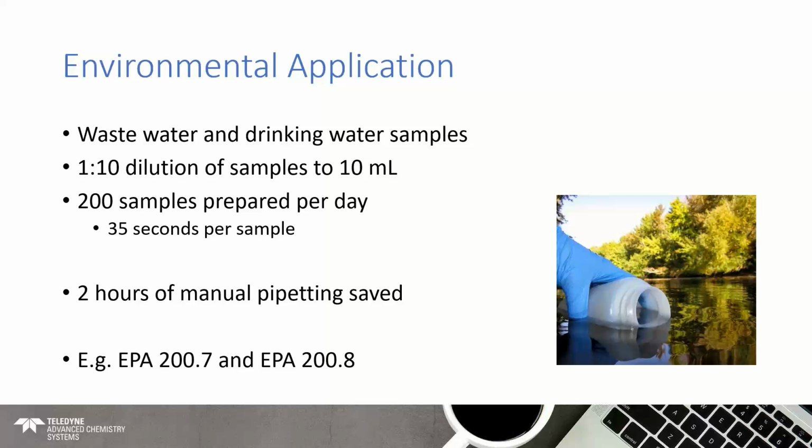An environmental application: the analysis of wastewaters and drinking water samples. Such samples are received by numerous water companies on a daily basis. These samples are analysed for various analyte elements that we want to know whether or not they're in our drinking water and at what concentration.